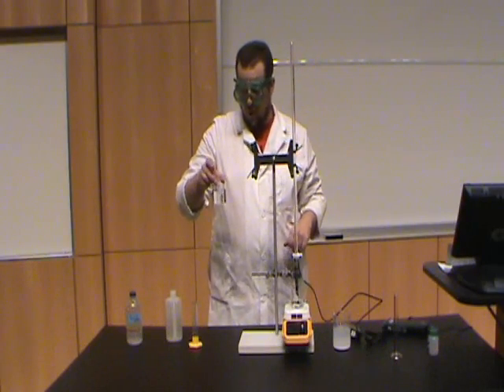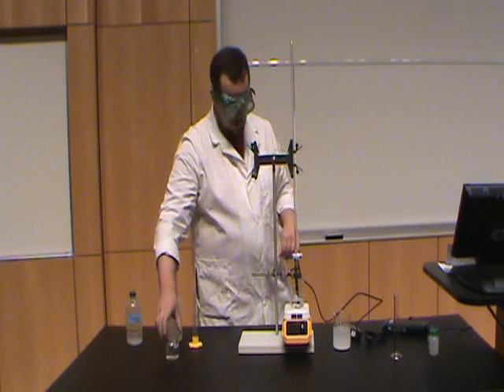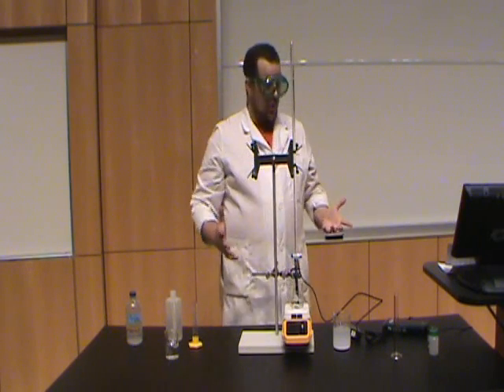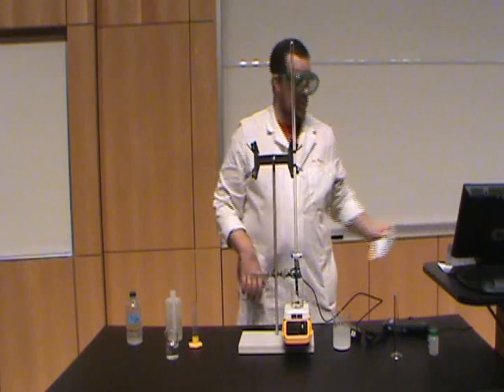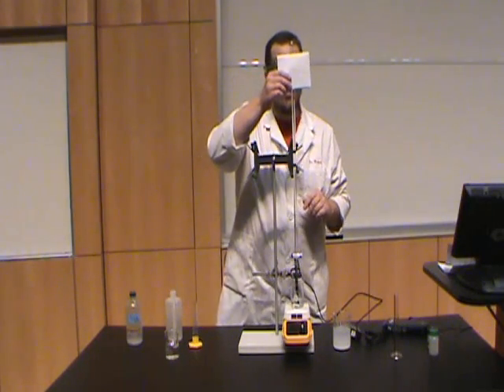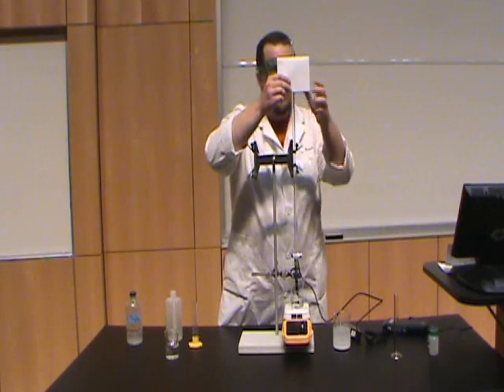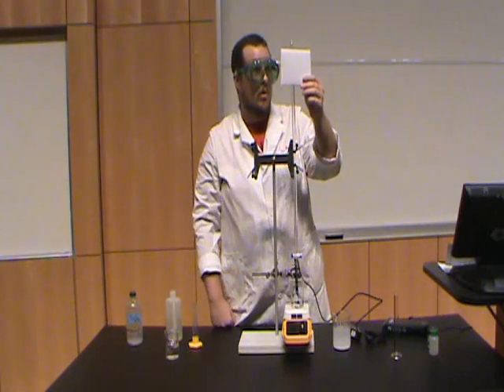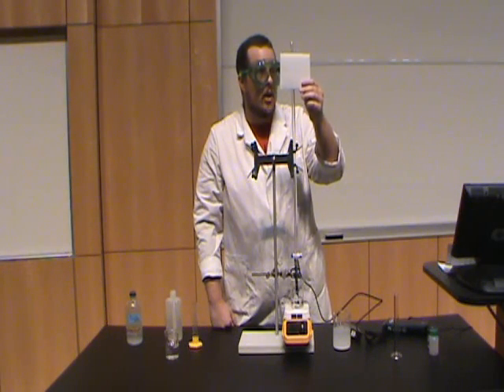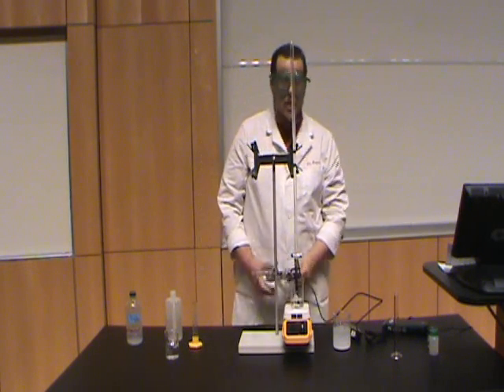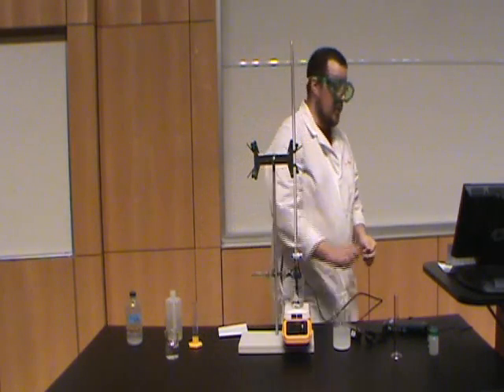I've already filled up my burette with the sulfuric acid solution. So we need to take our initial reading. Okay. So looking at the burette, looks to me like our initial reading is 0.33 milliliters.